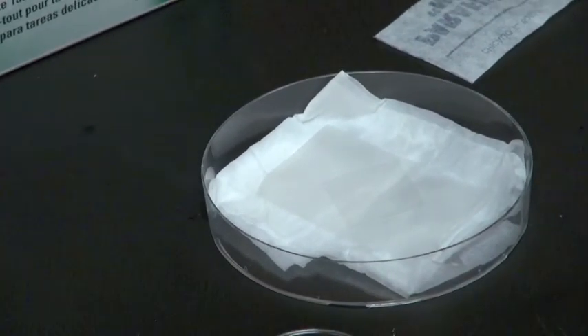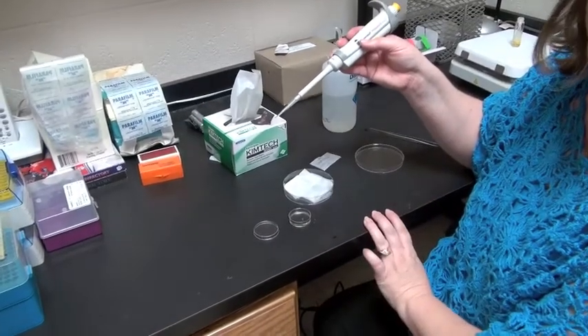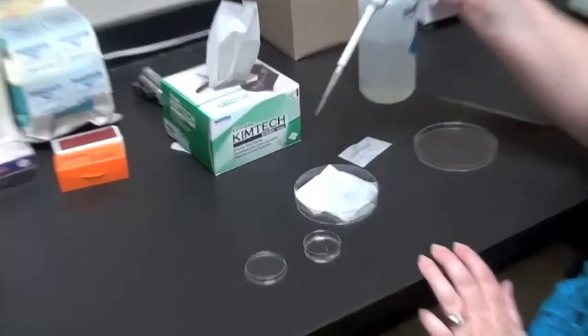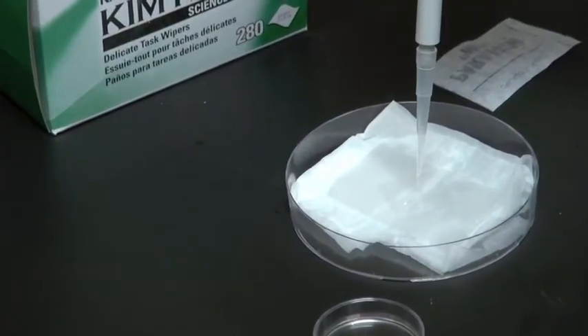Now I'm going to put a very small drop of my stain — this could be antibodies — and I'm going to pipette it directly onto my cover slip.